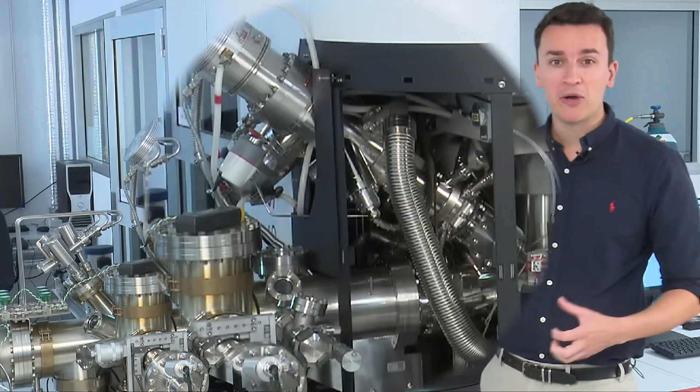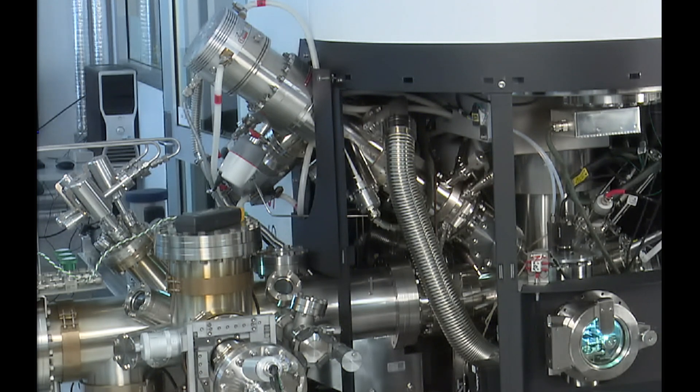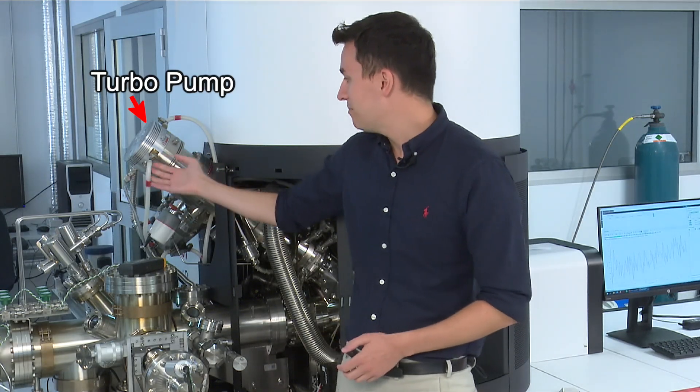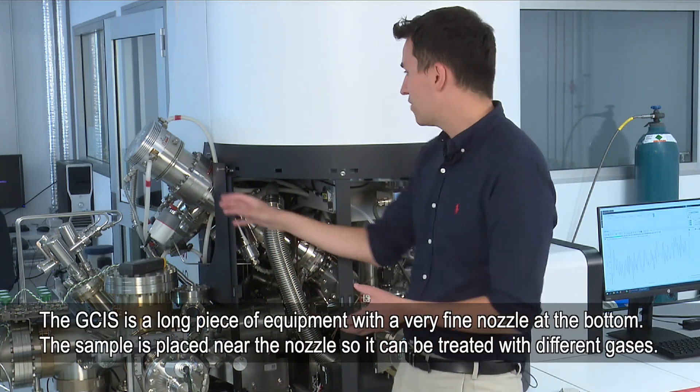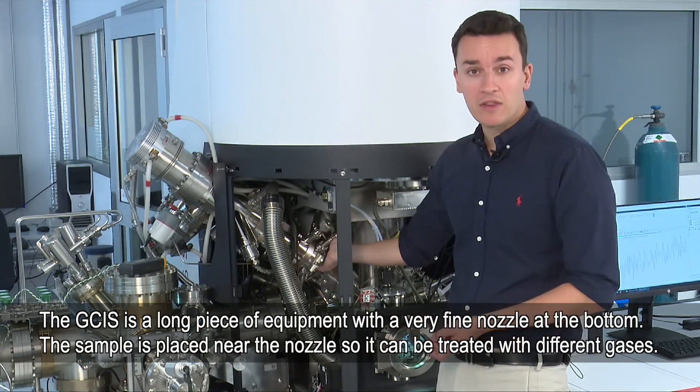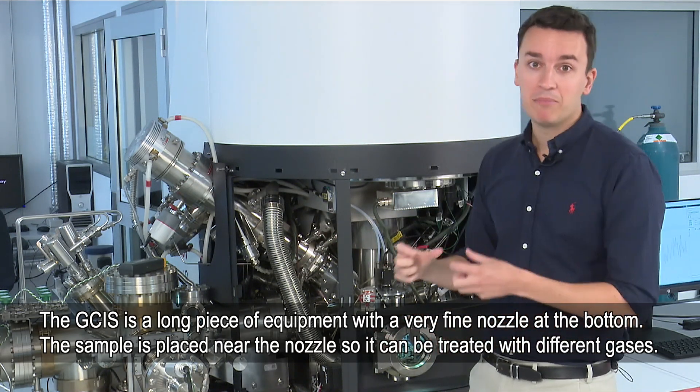Now we've taken the sides off we can see the components in more detail. Looking at the GCIS, it has a turbo pump at the top, and you can see these pipes here which are just to cool the turbo pump down because it does get very hot. The GCIS is a very long piece of equipment with a very fine nozzle at the bottom, and that is where the sample is placed.